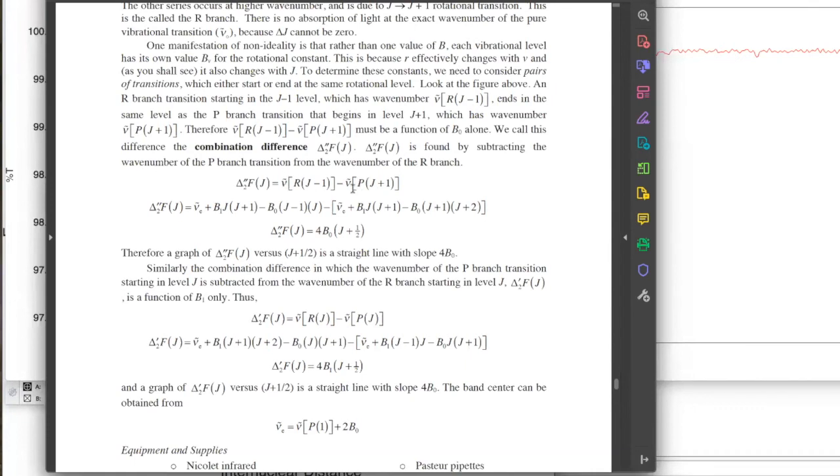Subtract those two. How do we do this? I did program in Igor to do it. If you want to use Excel, you can do this. What you have to do is move, right? You have those two columns of all the frequencies, copy them, move them over. One you're going to move down, one you're going to move up, and then you can subtract the two from each other. Think about it in terms of an Excel spreadsheet, and you can get it to work pretty easily. This is the one place where a spreadsheet really works easily.